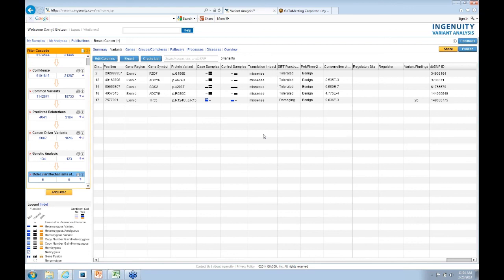But what I've tried to do is give you some tips for ways to minimize the artifacts, so that what you're left looking at are the ones that have more confidence associated with them, and hopefully the biology that you're also looking at is in that set. Like I said, sequencing is not necessarily the cleanest and easiest data to work with, particularly in certain regions of the genome. We just have to admit the fact that certain areas just do not sequence well.